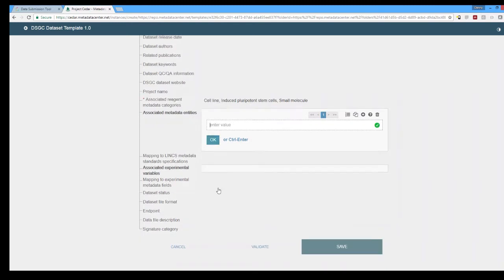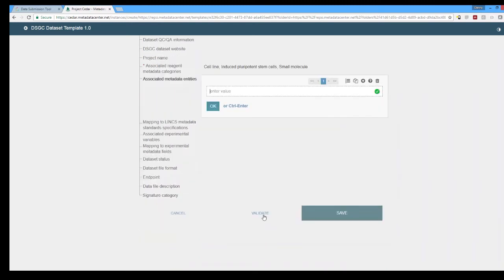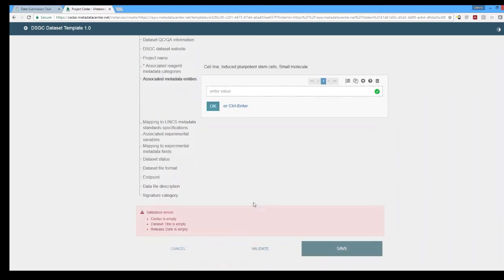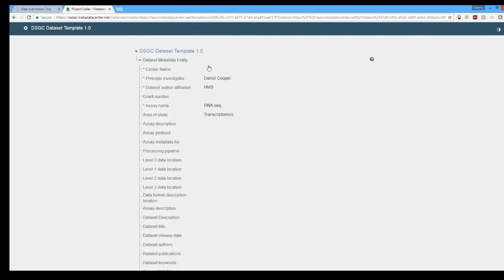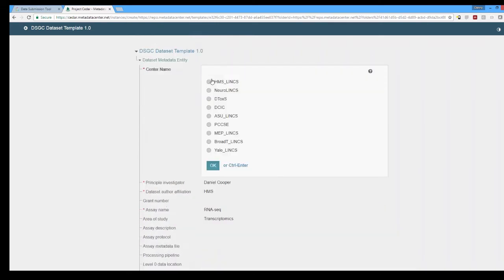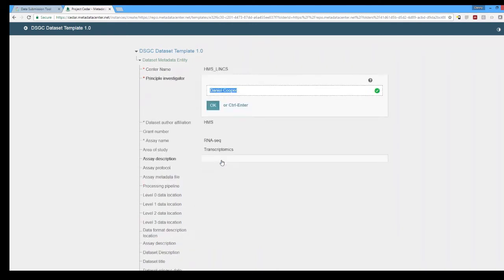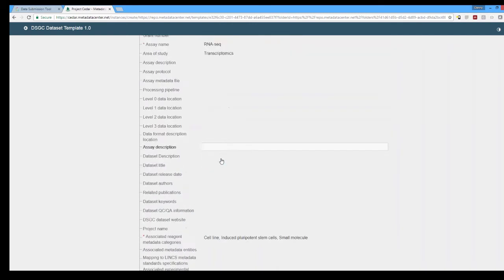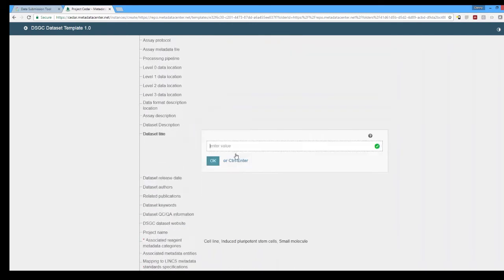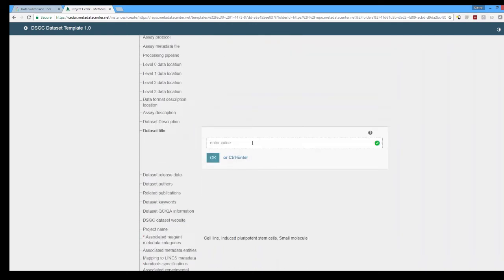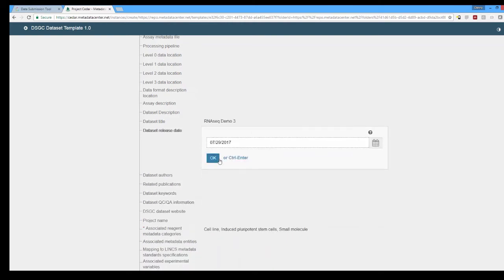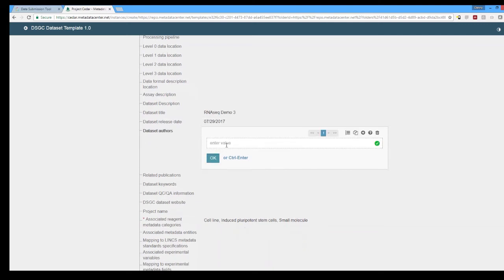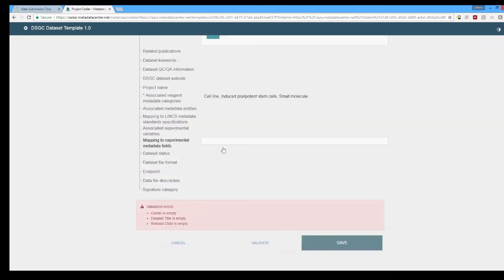So we go and we click on validate and we notice that we are missing several fields. So we're going to go back and fill those in. Now again this is not solely based off of the Cedar requirements but the requirements that our validation server has. So you'll notice dataset title and dataset release date are not required by the Cedar template itself. So we go in and we'll select the date that we are submitting this and now we'll go back and we will try to validate again and we get no errors.